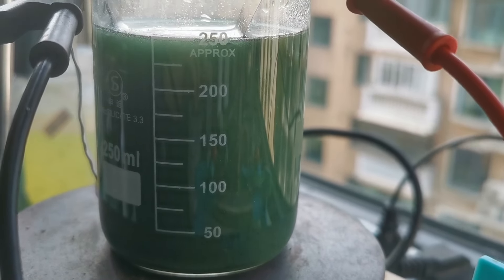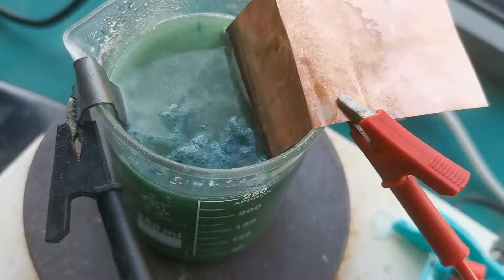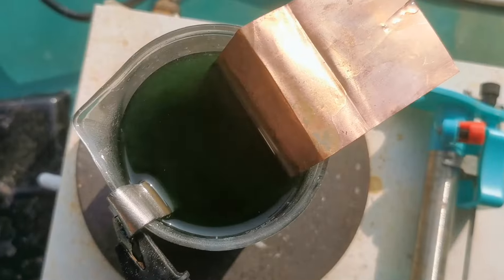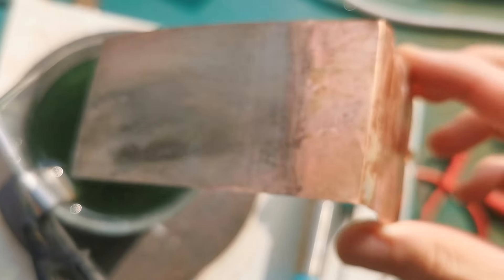I fixed this by adding a round amount of solid sodium hydroxide and testing the pH, which came to around the ideal value of 3. Just a few seconds after, some shiny deposits of nickel began forming on the copper.